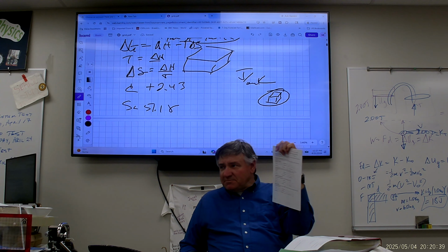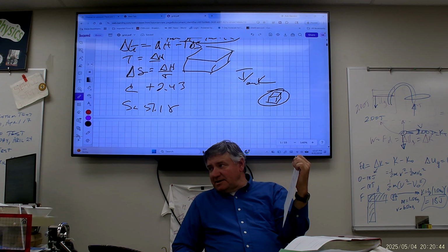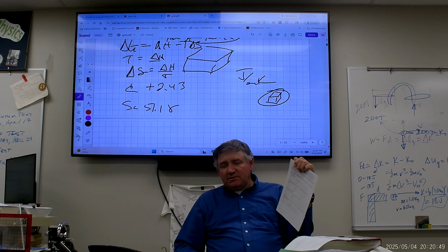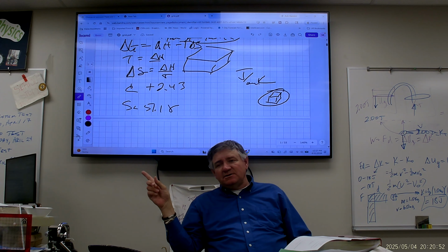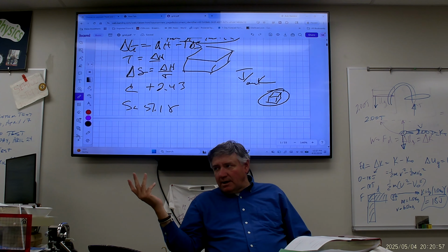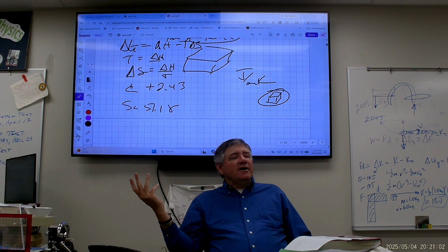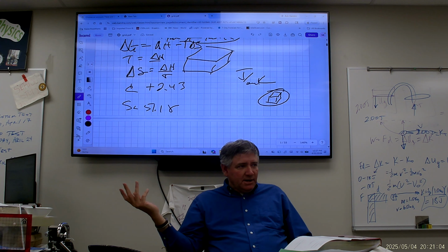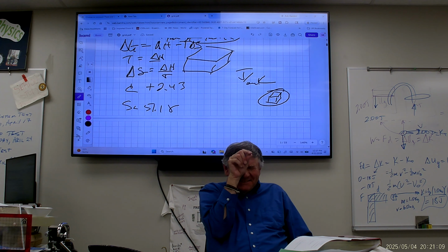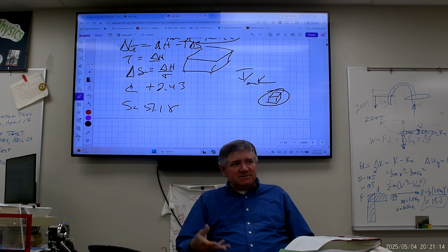On to the magnesium and hydrochloric acid. Okay? Now, you're going to take a small piece of magnesium ribbon. You all have done this before. Put that in about 5 milliliters of 1 molar hydrochloric acid. Notice I did not say 5.00. This is not a quantitative calculation. You're going to put it in about 5 milliliters. Okay? Put it in a test tube. It says 5, not 5.00. Get over it. Okay? In about 5, drop in the magnesium, measure the initial temperature and the final temperature, make observations.